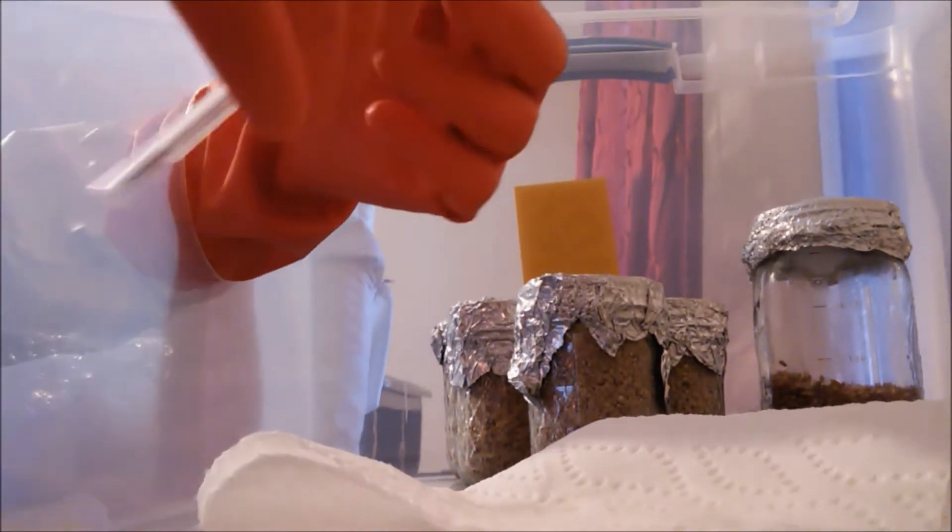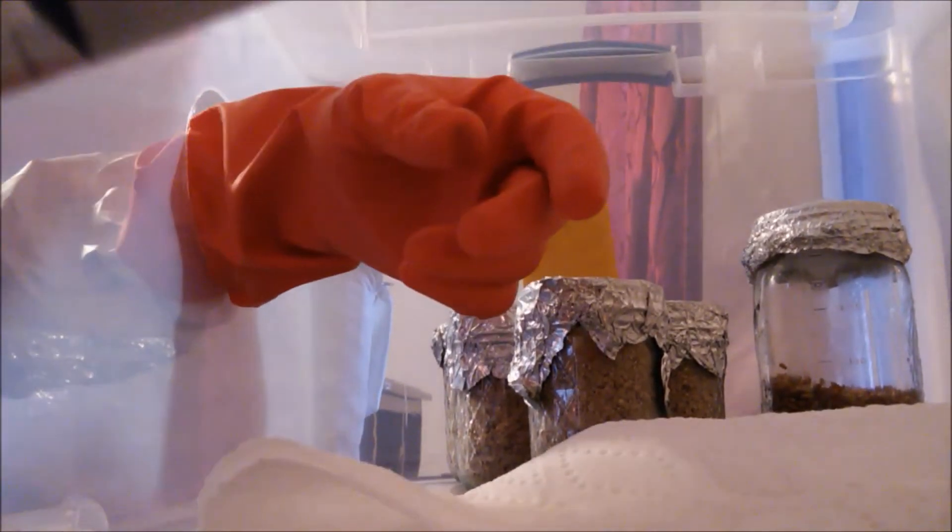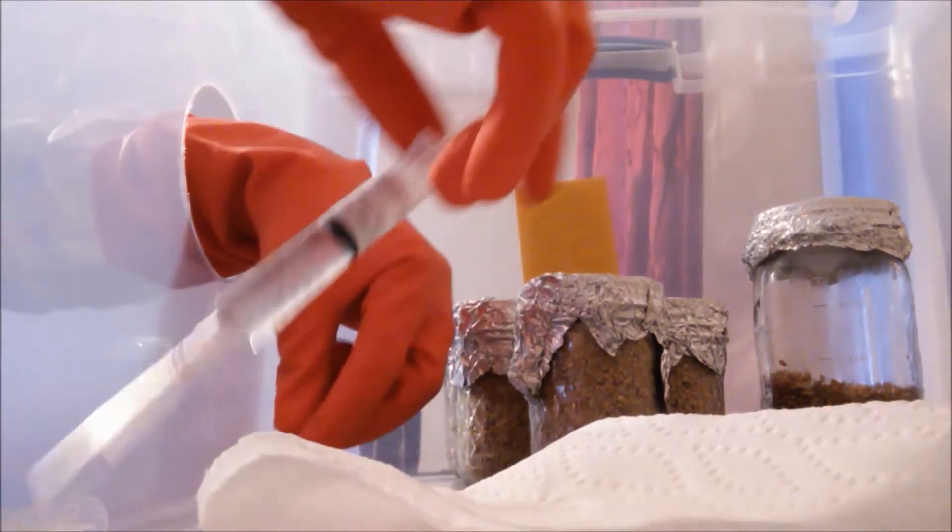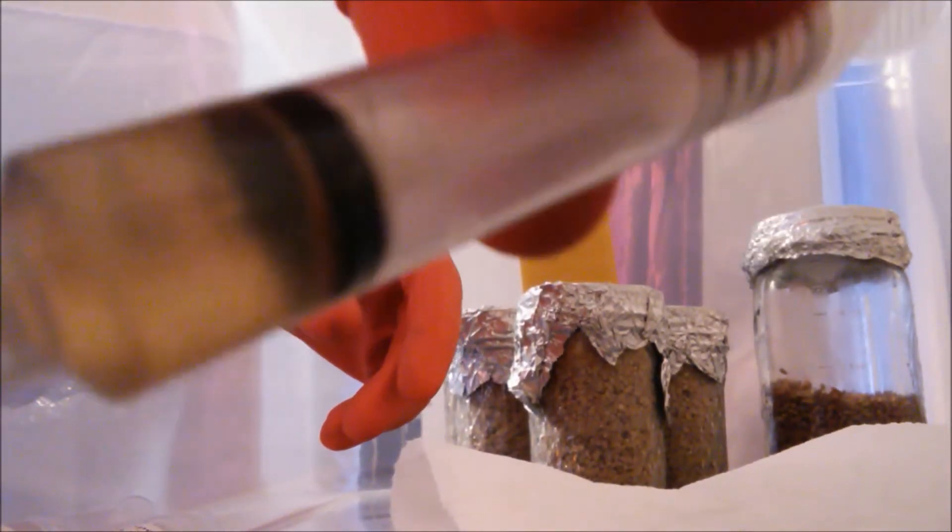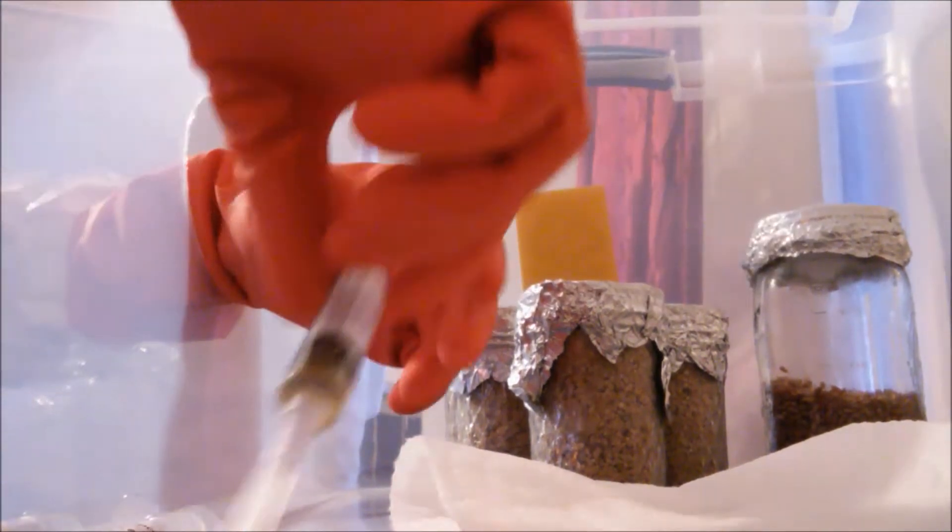We have our white oyster liquid culture. We also have our Lentinula edodes, this is our shiitake liquid culture. And we have our golden oyster liquid culture that we're going to be inoculating.